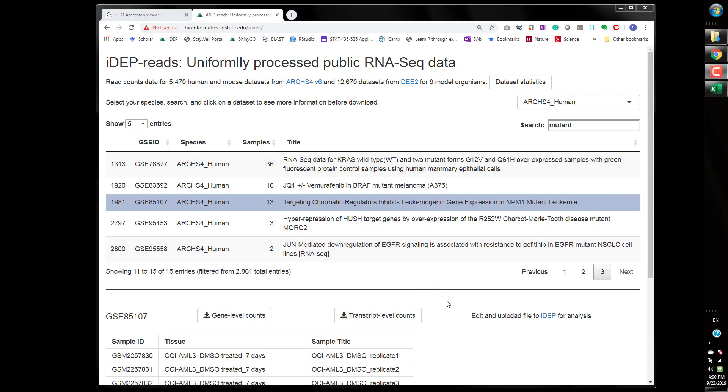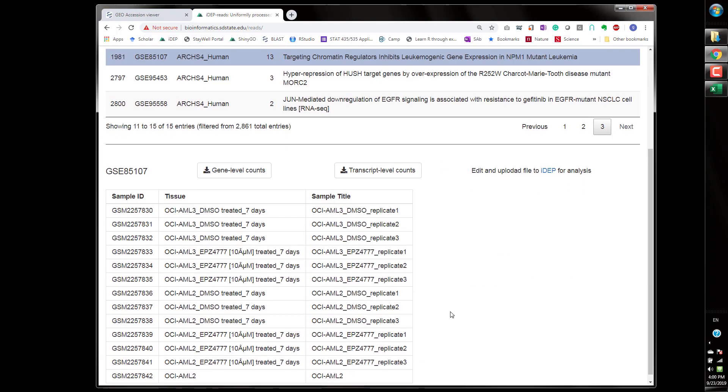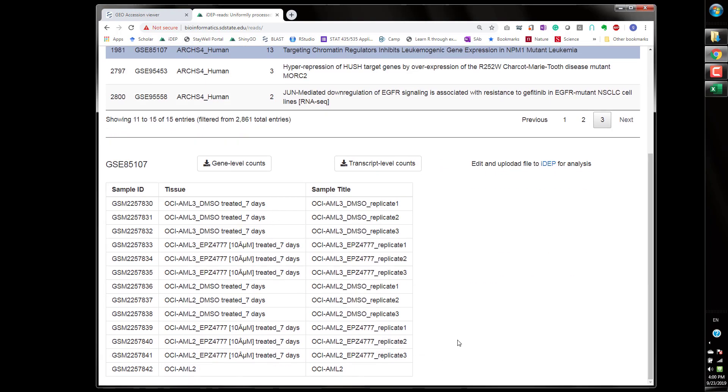The downloading is finished as you can see there's 13 samples in there and this is one of a very typical design. We have two cell lines or two genetic backgrounds with and without treatments with four groups.